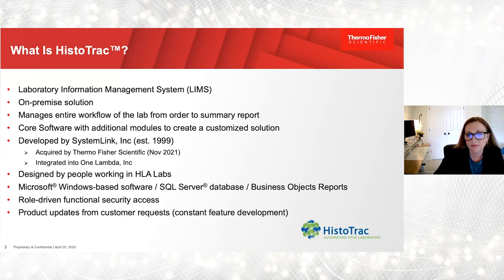It was developed by SystemLink in 1999. And at the end of 2021, we were acquired by Thermo Fisher Scientific and integrated into One Lambda. HistoTrac was designed by people that work in HLA labs. It is Microsoft Windows-based software, SQL Server database, business objects for reports. It is role-driven for functional security access, and it is updated for customer requests throughout the world.